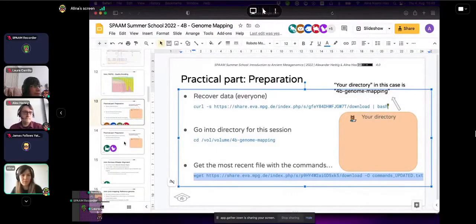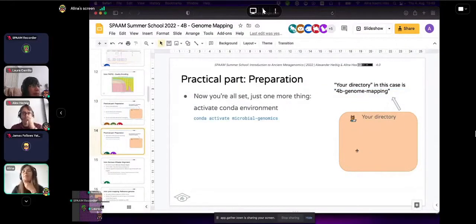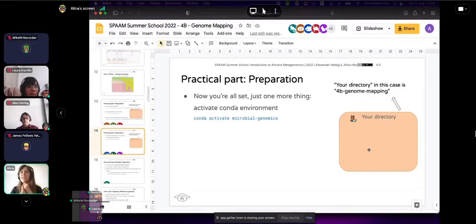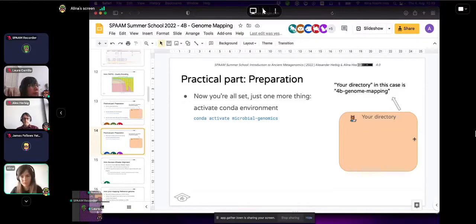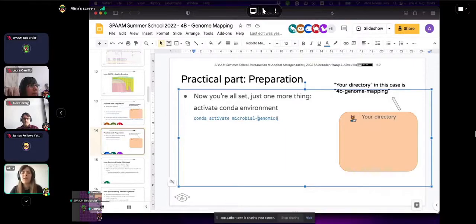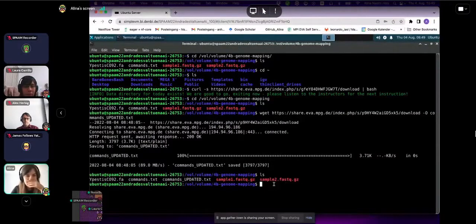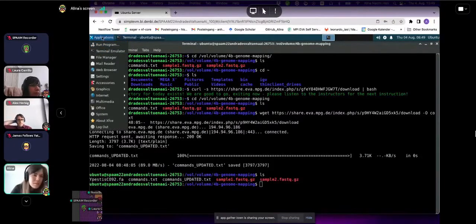What I'd like you to do is open the commands_updated.txt file in a text editor. You can type mousepad in your terminal, then go to File > Open. Navigate via Other Locations > Computer and find the wall directory, then go into the 4B genome mapping directory to find the updated text file and open it.